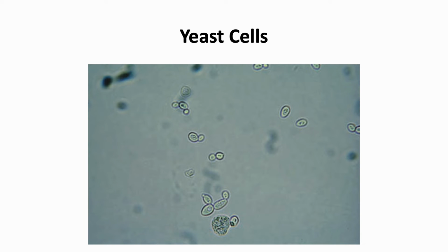The presence of yeast cells in budding forms aids in distinguishing them from red blood cells. So they appear as small, refractile, ovoid structures that may or may not be budding. Severe infections can also show branched or mycelial forms, and the presence of yeast cells is also reported semi-quantitatively. Most commonly, the yeast cells present in the urine are of the Candida albicans species.